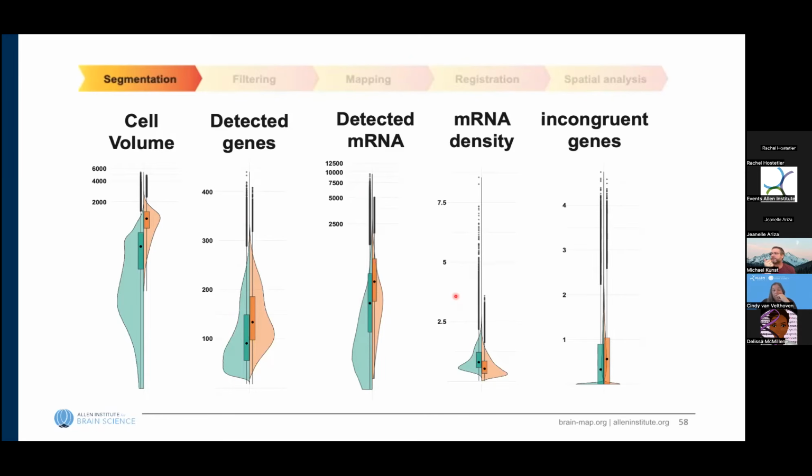If you remember the earlier cylindrical cell shapes, you saw that the area where the actual mRNA is decreases the further away you go from the cell body, and that extracellular mRNA has a much lower density. By not including all these low density areas, we increase the overall density of mRNA within our cells.